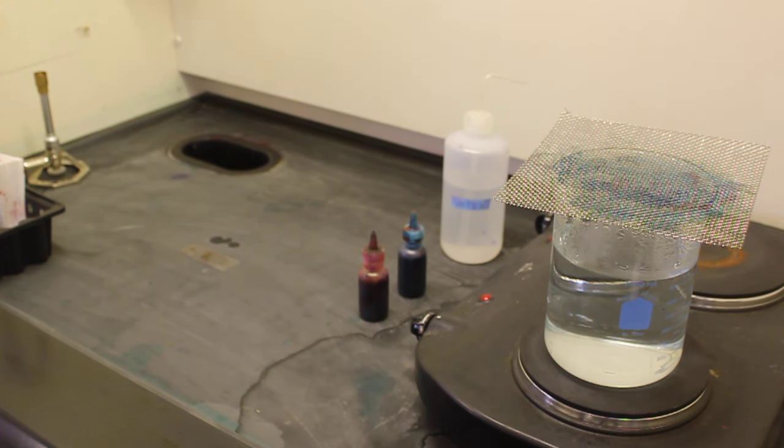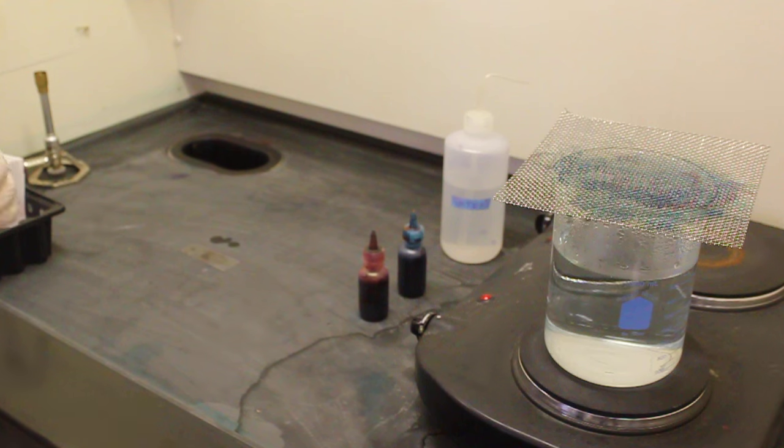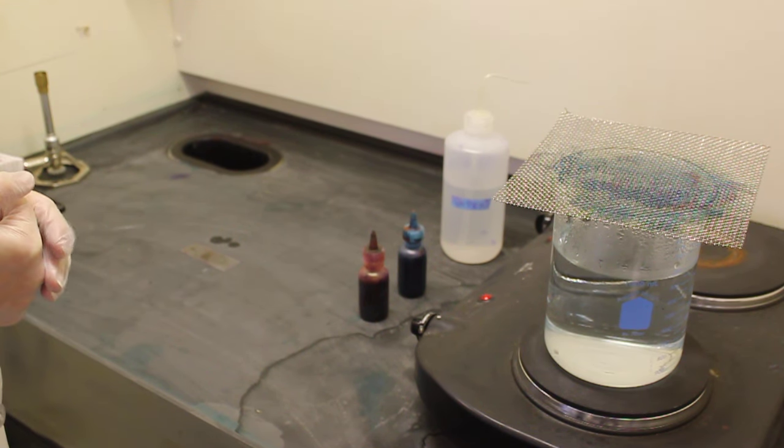I am now going to demonstrate the endospore stain. The endospore stain is a different type of differential stain. At the end of this stain, you will be able to differentiate through a microscope between a vegetative or living cell and an endospore.